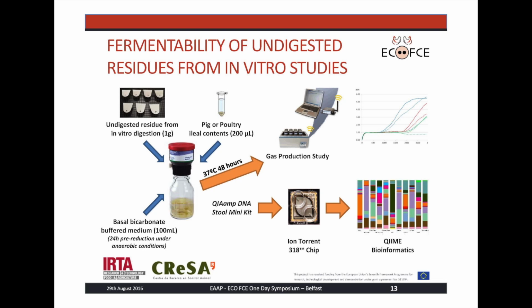We also, at the end of this incubation period, collected a sample of this microbial incubation, and we did some deep sequencing and analysis of the microbiota, and we tested to see how the residue affected the composition of the microbiota with the liquid approach.